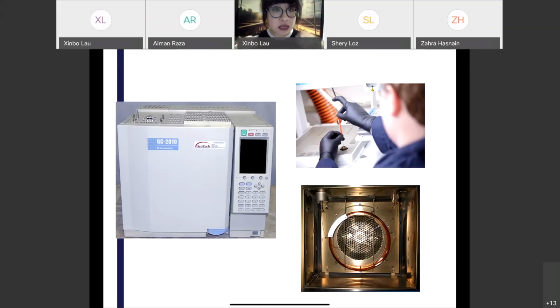As I said, some people actually have their whole career based on chromatography, either GC or HPLC. Actually, I worked for a small company that was working on GC, and specifically portable GC. So they were developing a GC instrument with the intention that we can detect disease.